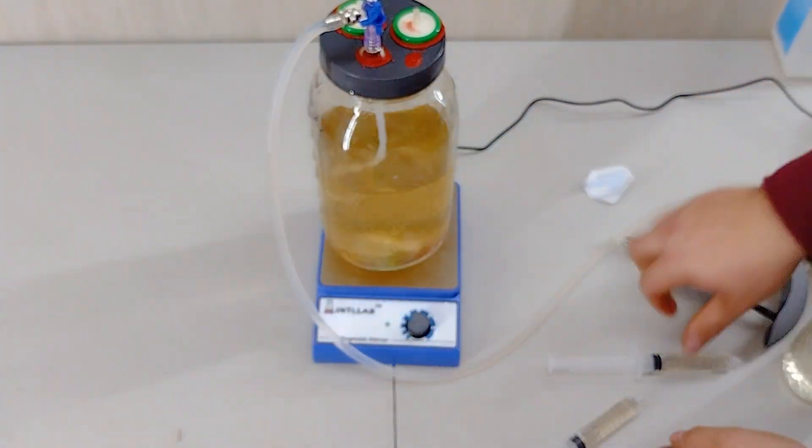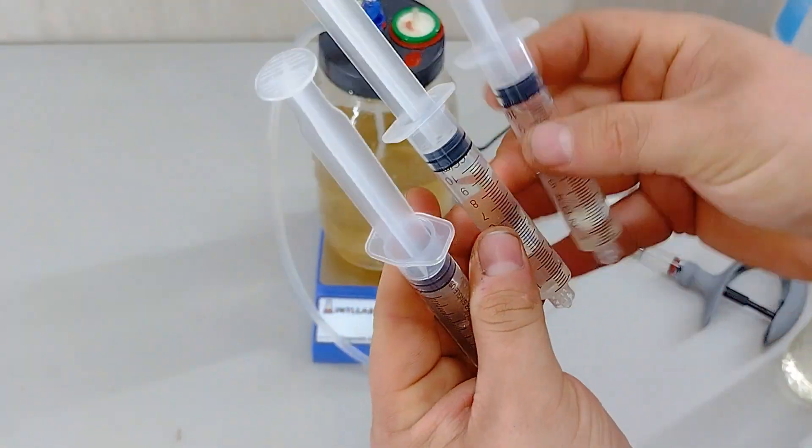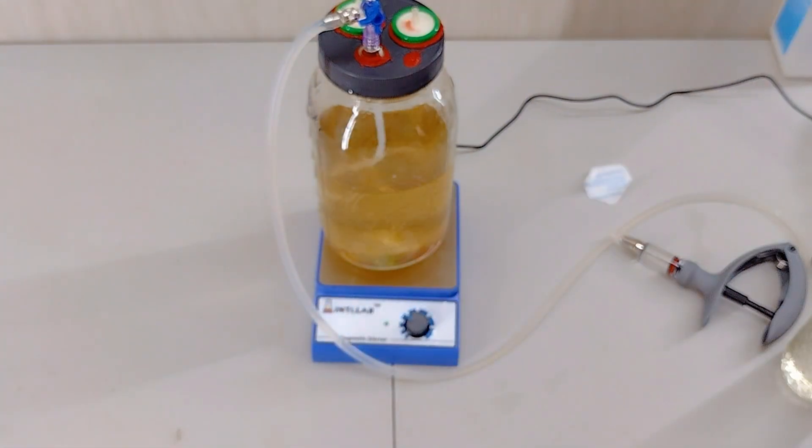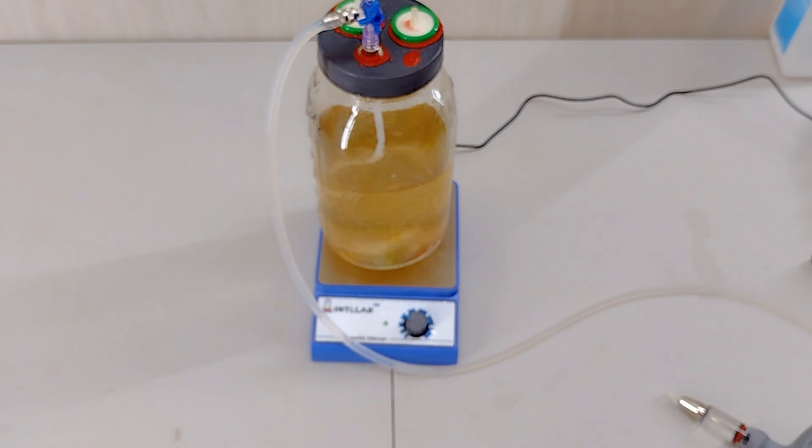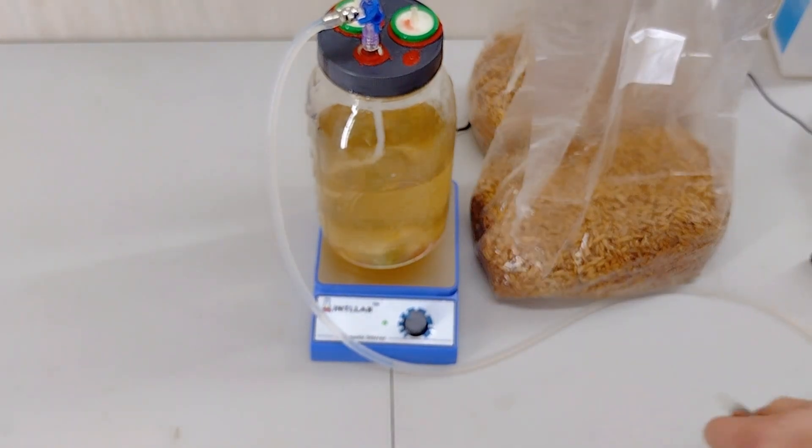The only thing you would need is some sterile caps, and you could either fresh-cook those, or I like to have mine in isopropyl alcohol. So, now that you saw how to fill syringes, now we can move on to doing grain bags.